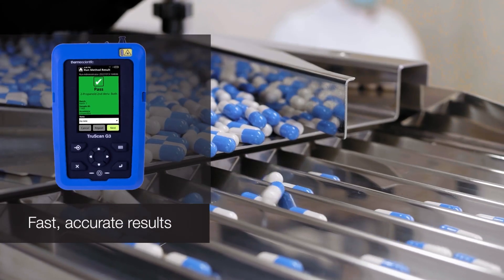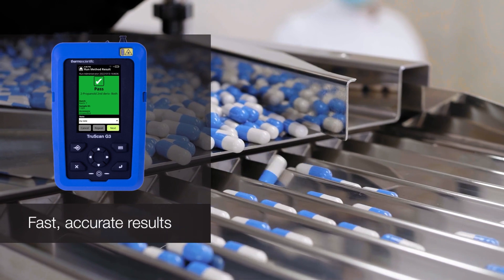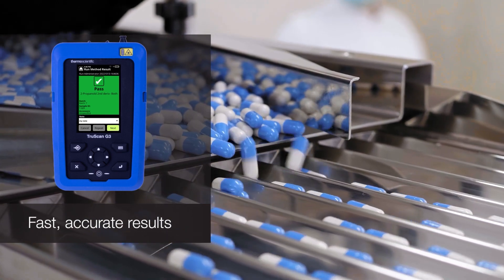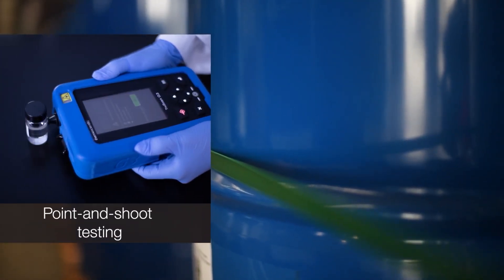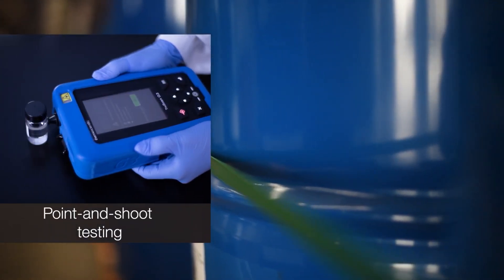Supported by our trusted P-value, the TruScan G3 handheld Raman analyzer delivers fast, accurate results, and its effortless point-and-shoot testing ensures continuous pharmaceutical manufacturing.